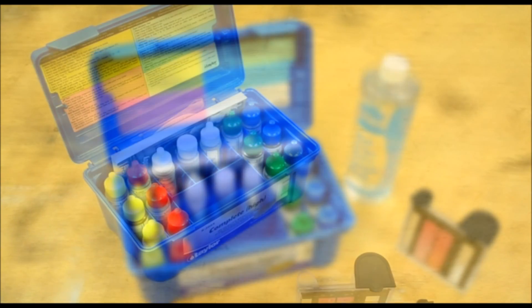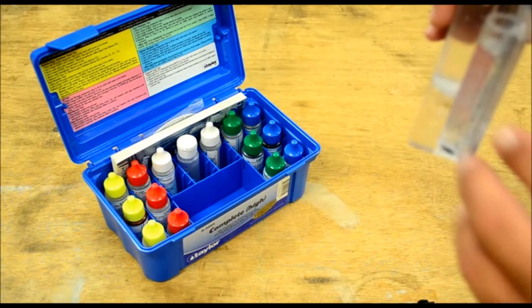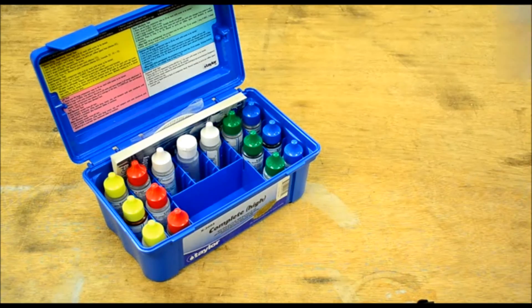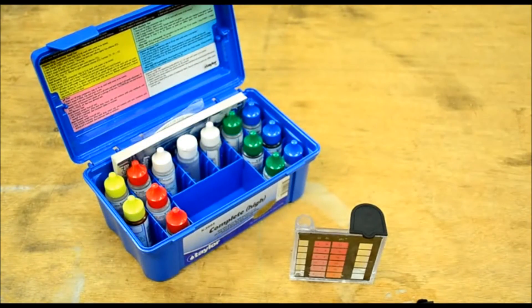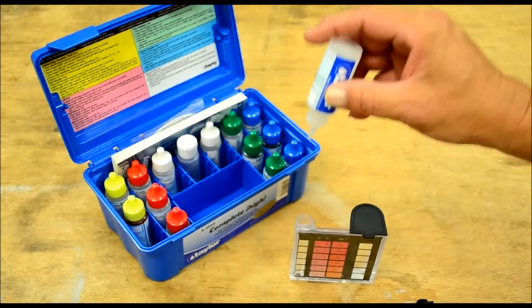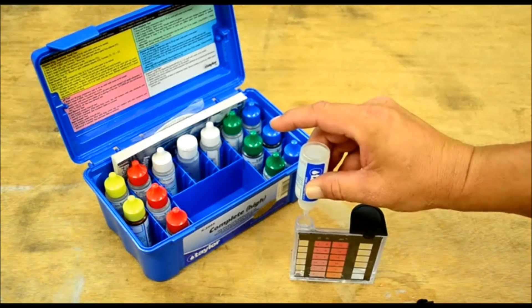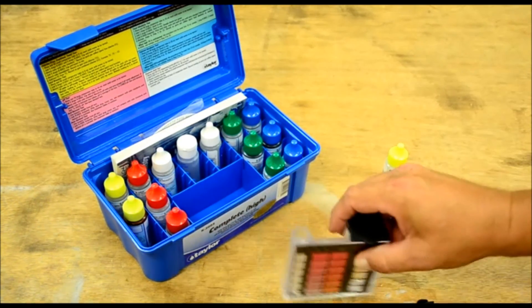We're going to test the chlorine first. I went ahead and filled up my test vial to the top level here. Take reagent number one, hold your bottle straight down, and put in five drops — one, two, three, four, five — then mix that.